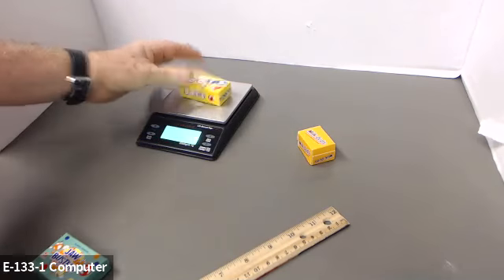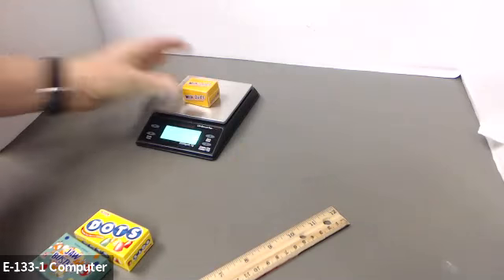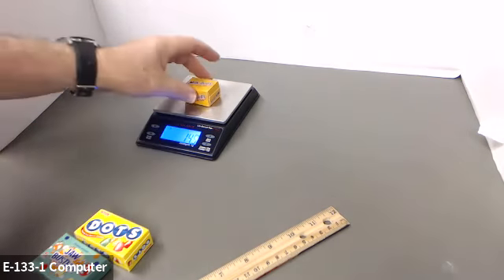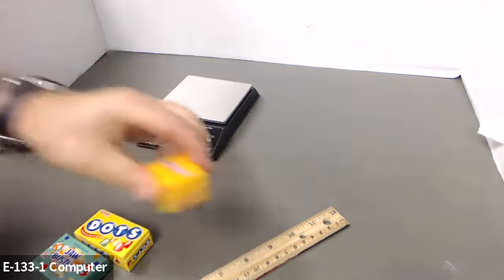The dots. Oh, the dots is pretty massive. It says 23.8 grams. Okay. And then last but not least is the milk duds. I get 14.9 grams for the milk duds. So the milk duds are the least massive. Let's take a look at these.